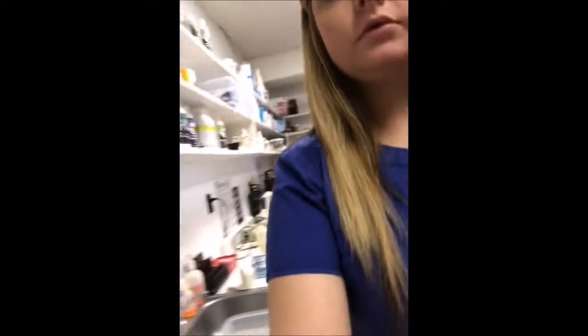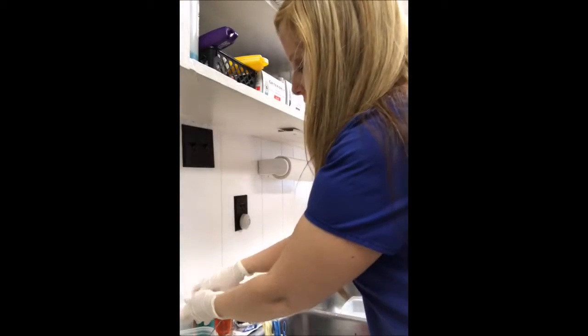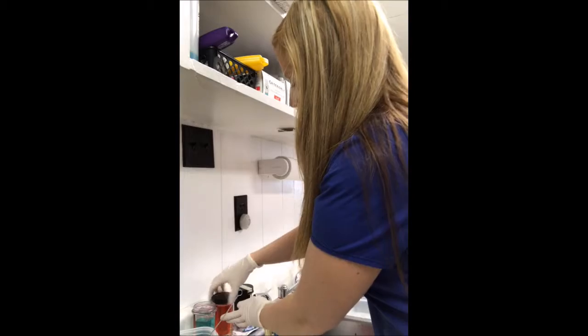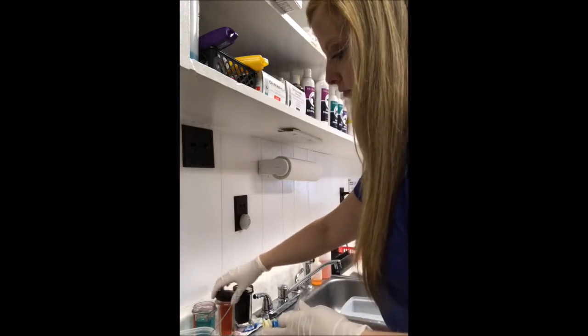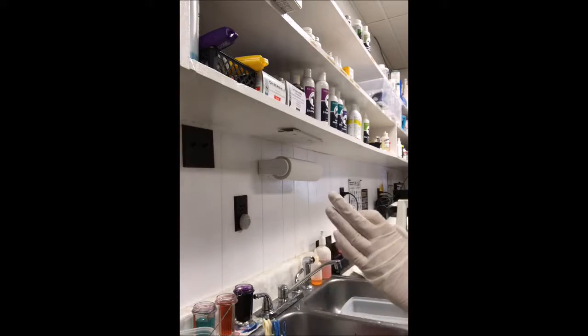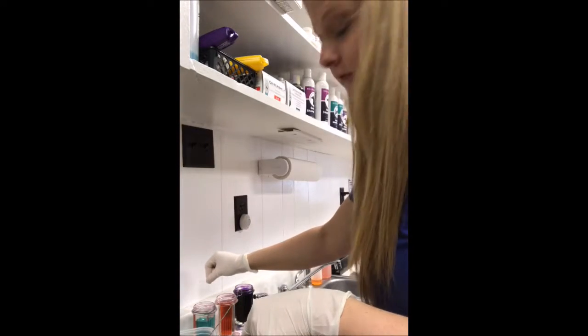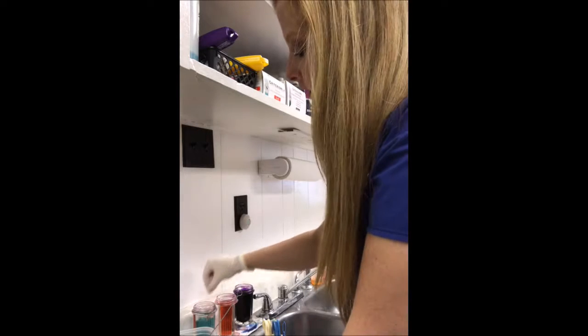Okay, so now we're going to stain it. Okay, so I have my different stains here. I'm going to do 30 for the alcohol, 15 for the other two.